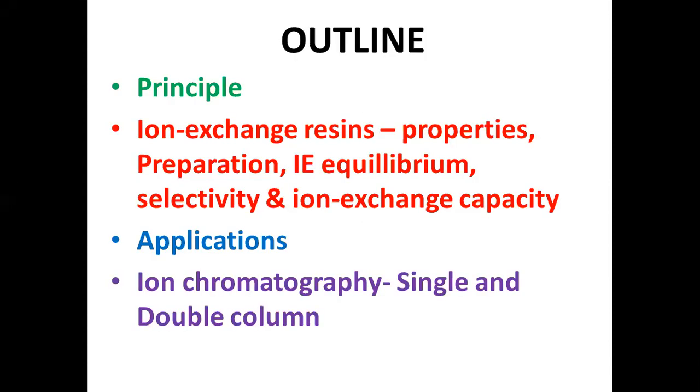All these things are very, very important. Let us go one by one. So in today's discussion, this is going to be the outline of my presentation. We shall discuss the principle of ion exchange chromatography, the ion exchange resins which are commonly used as stationary phases, the properties of ion exchange resins, and the preparation of ion exchange resins.